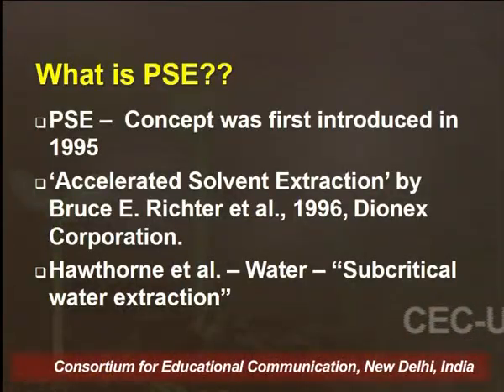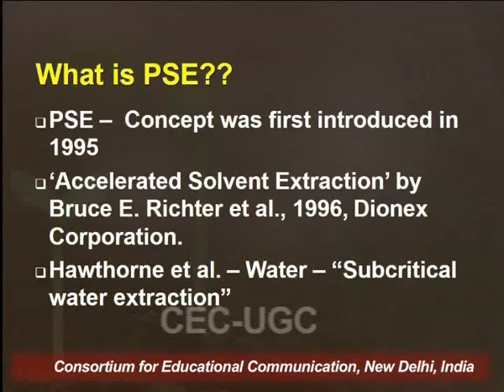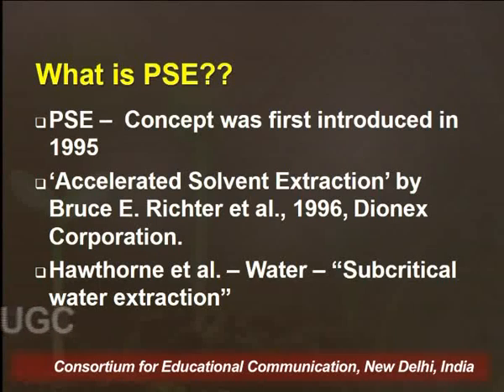Now during the same time, Hawthorne along with his research group were also working on this same concept, that is pressurized solvent extraction, but in this technique they were using water as a solvent. Now when water is used as a solvent in PSE, that technique becomes subcritical water extraction.